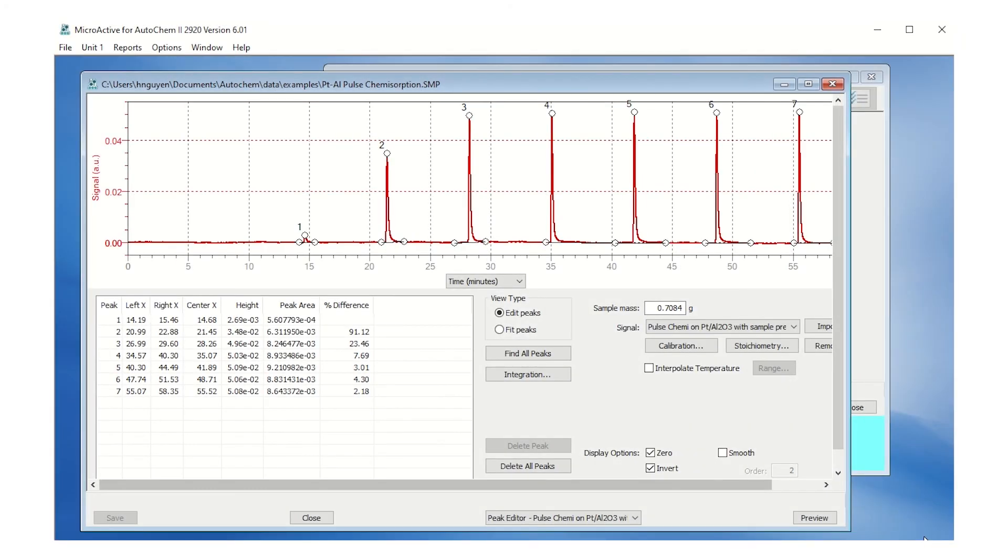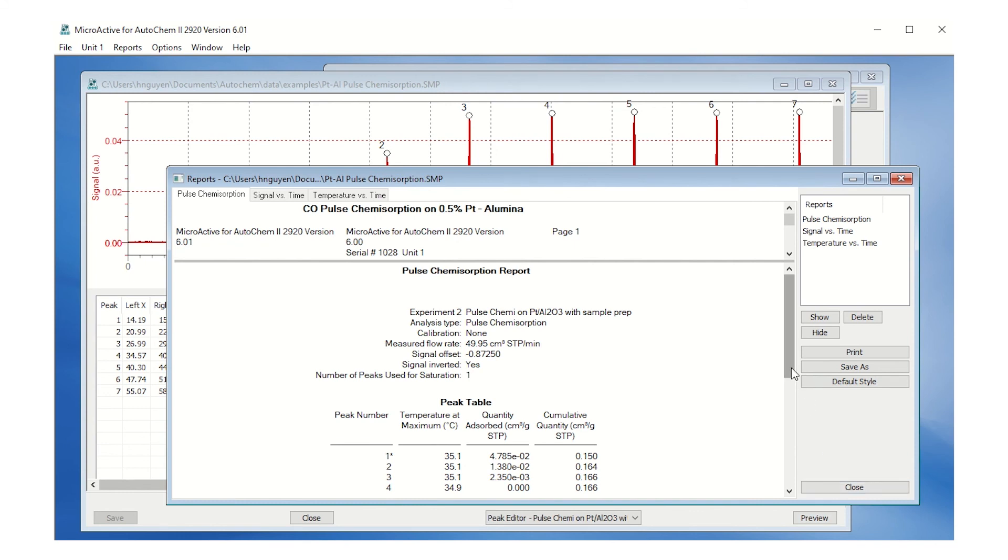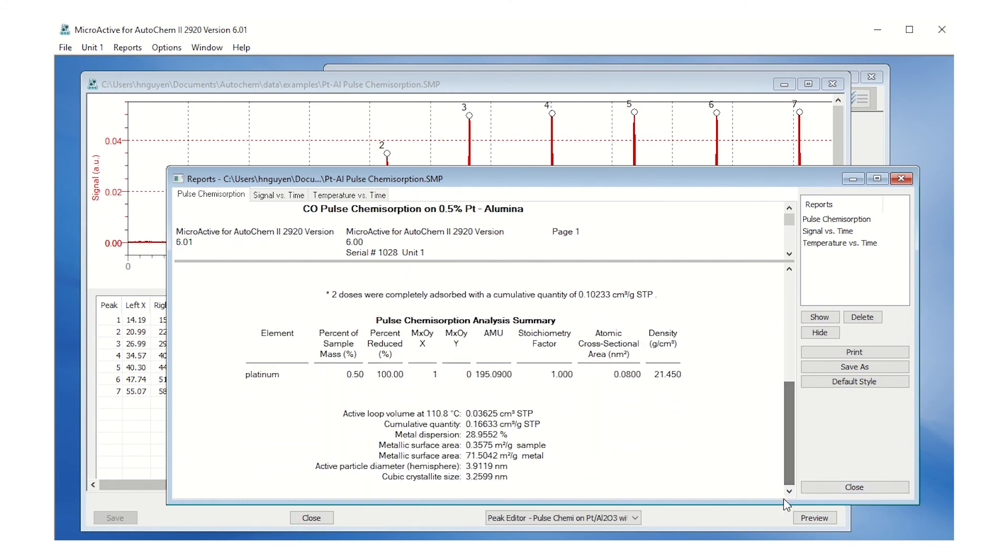Now the results are ready for viewing. Click on Preview on the sample file to display the report. Verify the measured metal dispersion within the specifications indicated on the manual of the reference material.